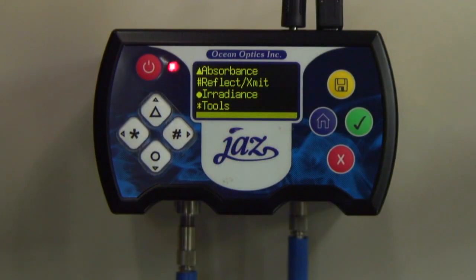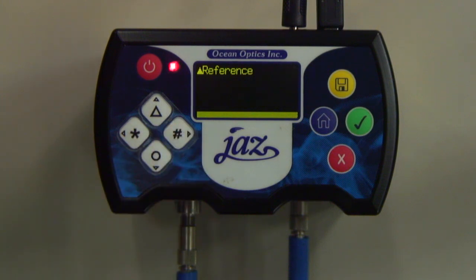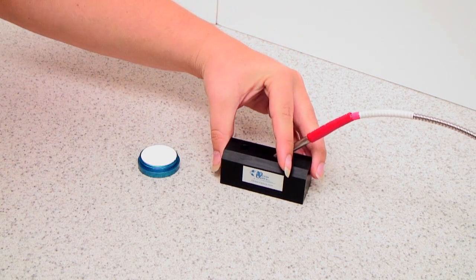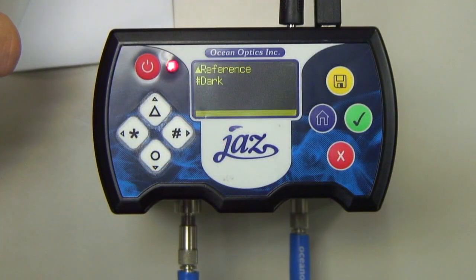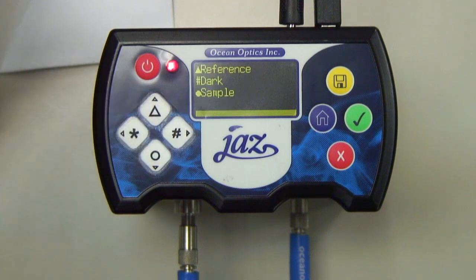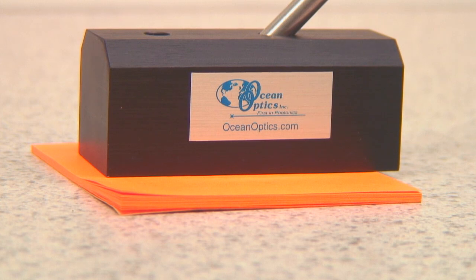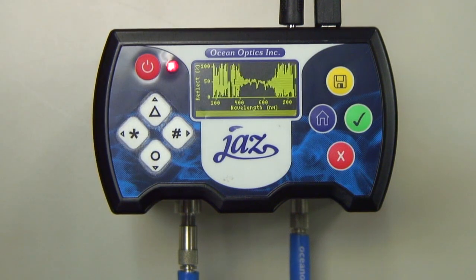In the Spectroscopy menu of the Jazz interface, select Reflectance Transmittance. With the reflection probe placed into the RPH1 and the RPH1 placed onto the WS1, press Triangle to collect a reference measurement. Then, by clicking Pound, we automatically disable the PX and take a dark reference. Now we will move the RPH1 onto the Post-It Note and choose Sample in the Reflection menu. We now see a reflectance spectrum displayed on the Jazz.